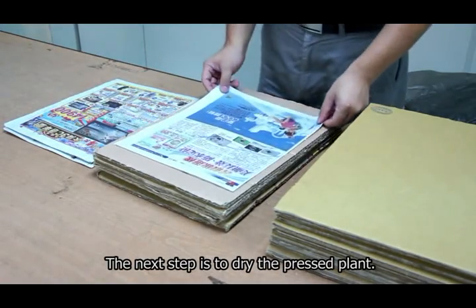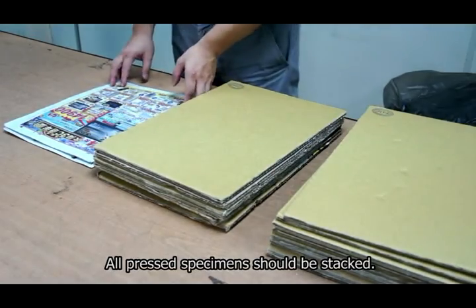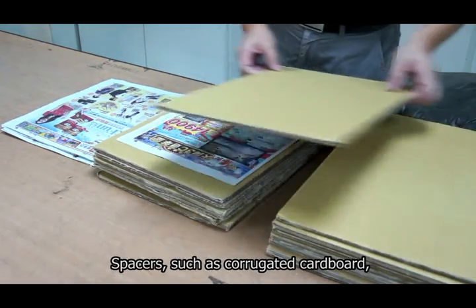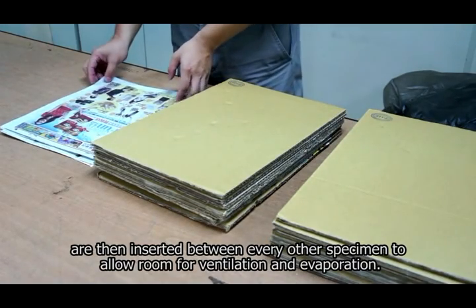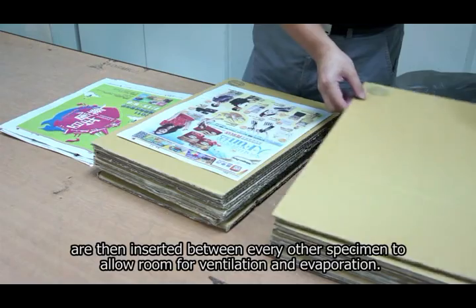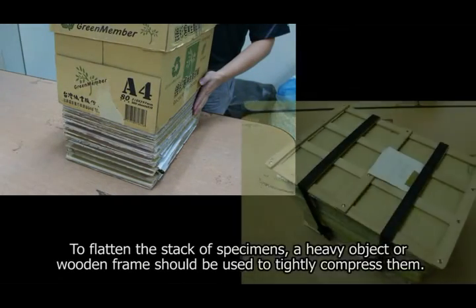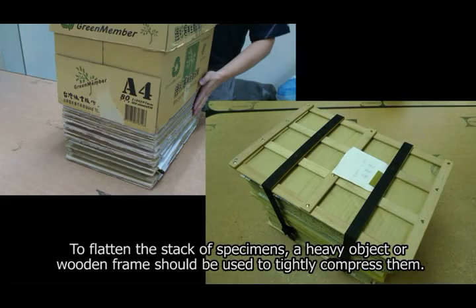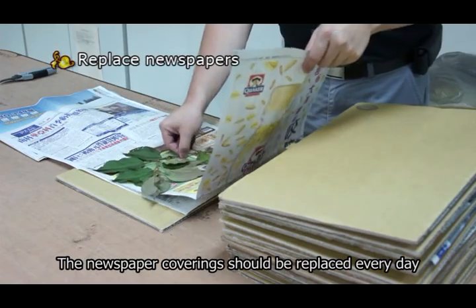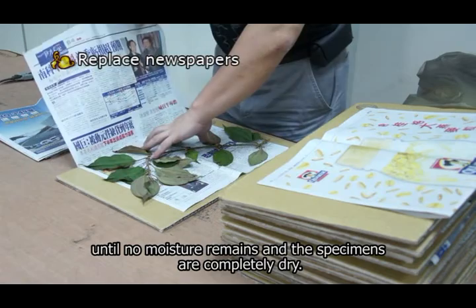The next step is to dry the pressed plant. All pressed specimens should be stacked. Spacers, such as corrugated cardboard, are then inserted between every other specimen to allow room for ventilation and evaporation. To flatten the stack of specimens, a heavy object or wooden frame should be used to tightly compress them. The newspaper coverings should be replaced every day until no moisture remains and the specimens are completely dry.